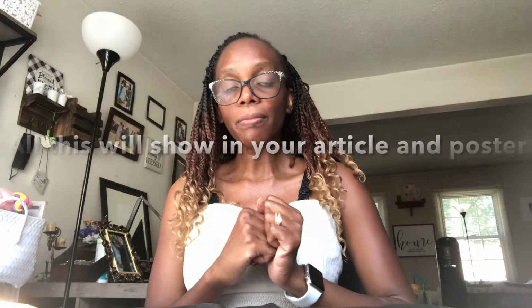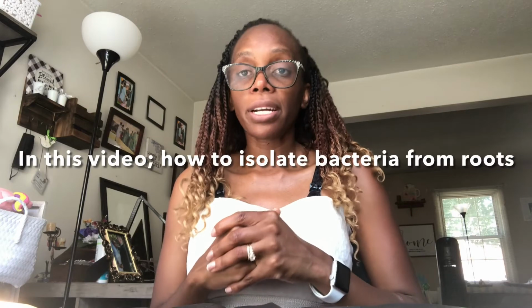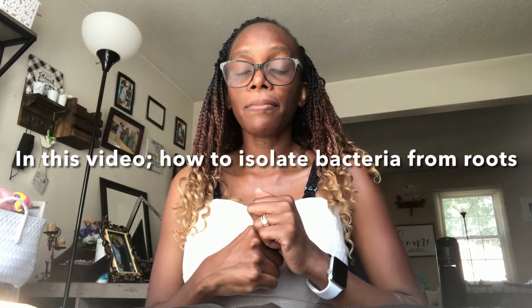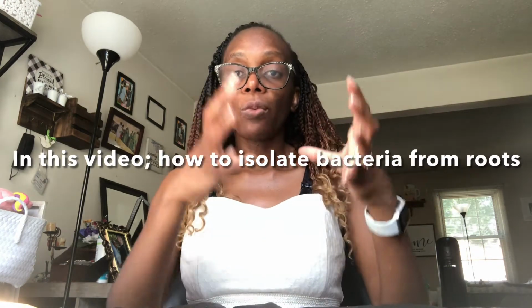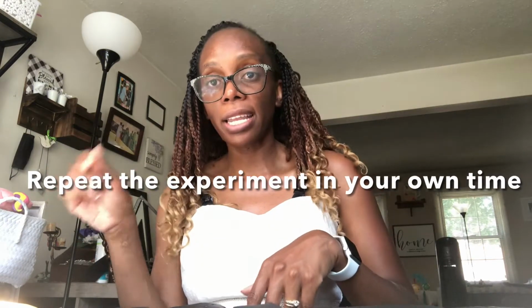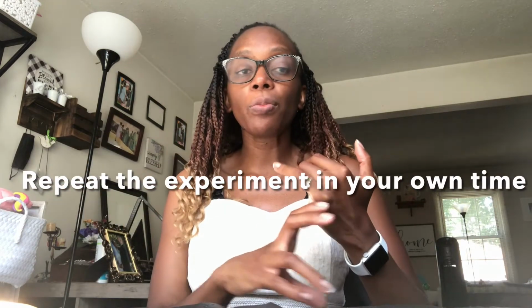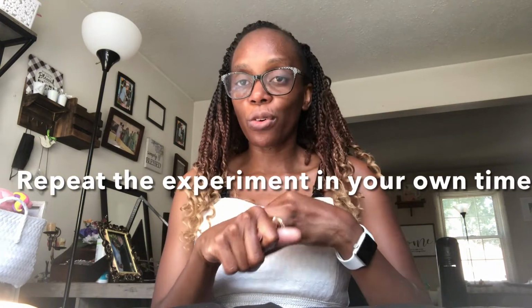Okay, so in this video I'm going to demonstrate how to isolate bacteria from roots. We did this yesterday in class, and for every experiment that we do in class, we do an experiment in one location or one pot, and then in your own time you have to repeat that for the rest of your pots. By the end of the week, by Sunday, you update your eLab notebook, and you also take photos and update them in your photo uploads.